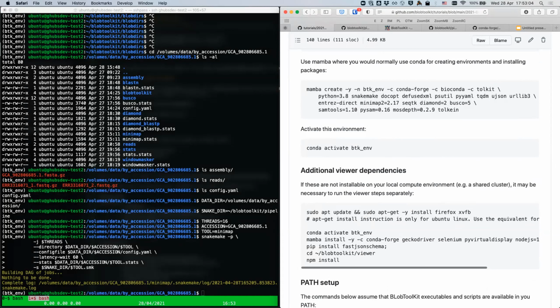Well, you already went onto the web page and showed. It's hard to know because I'm following and not doing. Right. But everything that we've just looked at in the browser. Yes, you're right. It is redundant. Sorry, I said this wrong. I'm so sorry. I thought I was being very clever by working backwards. My fault. So yes, it's redundant. We've already created a BlobDir, and there's no reason to run this step again.